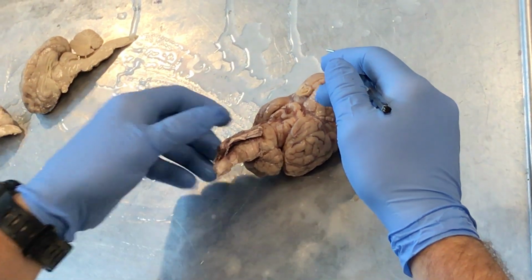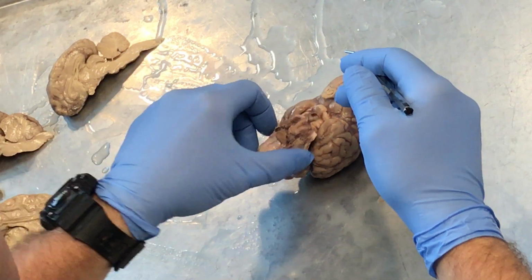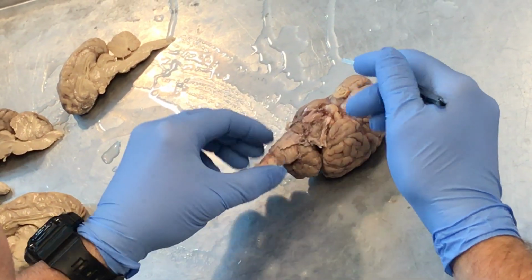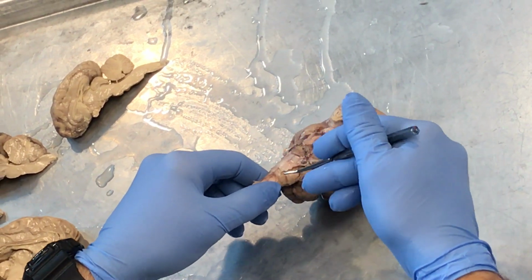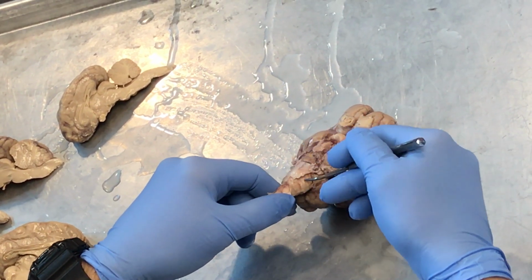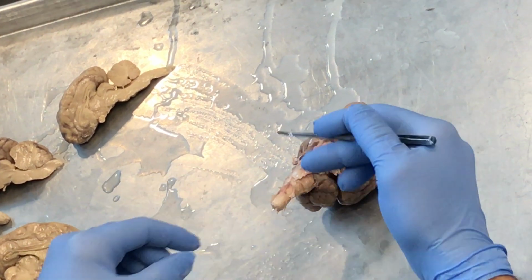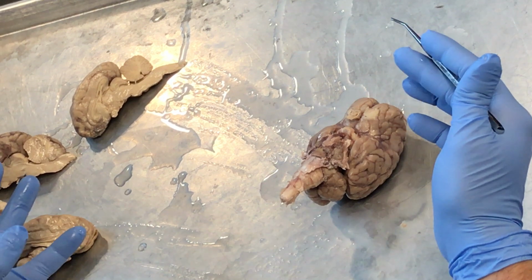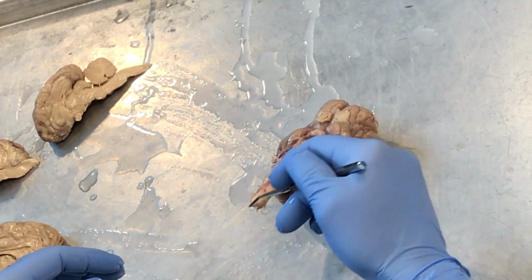So this right here is dura mater. This thick layer is opaque. Opaque means you can't see through it, whereas translucent or transparent means you can see through it. This opaque layer right here is the dura mater. Dura mater basically means durable mother or tough mother. Okay, so that's it right there.